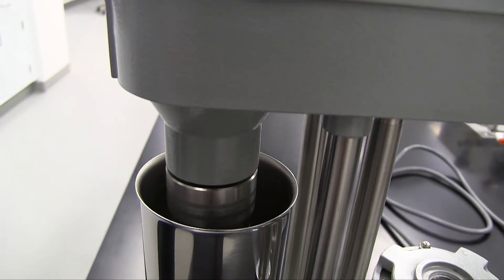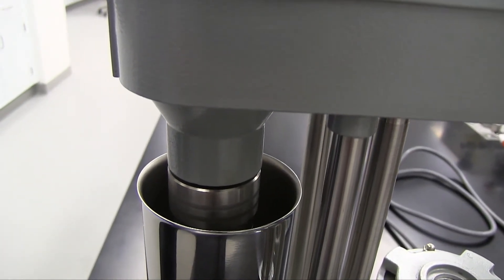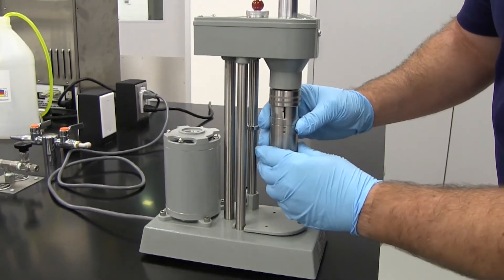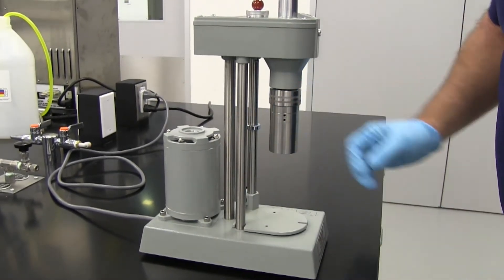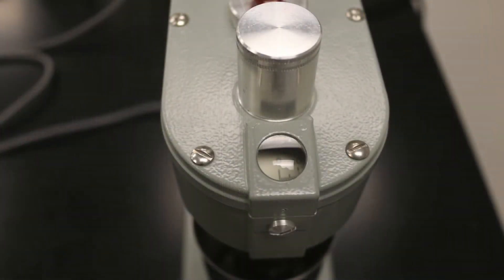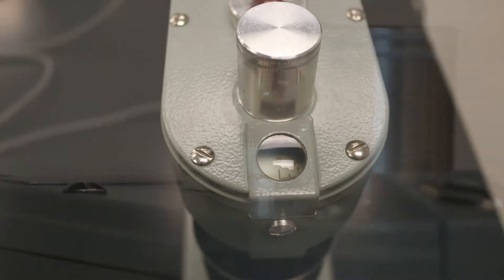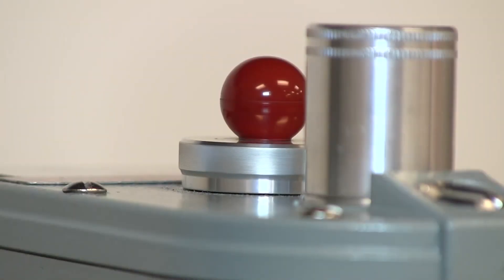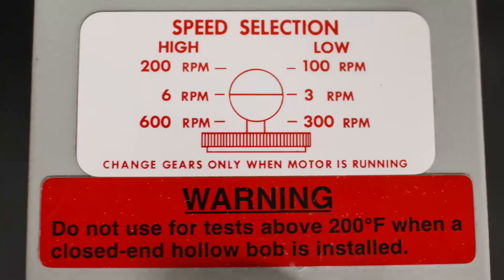This torque is transmitted to a precision spring where its deflection is measured on a dial. The Model 35 is designed for the viscosity in centipoise to be indicated on the dial with the standard R1 rotor, B1 bob, and F1 torsion spring at 300 RPM. Viscosities at other speeds may be measured by using multipliers of the dial reading.